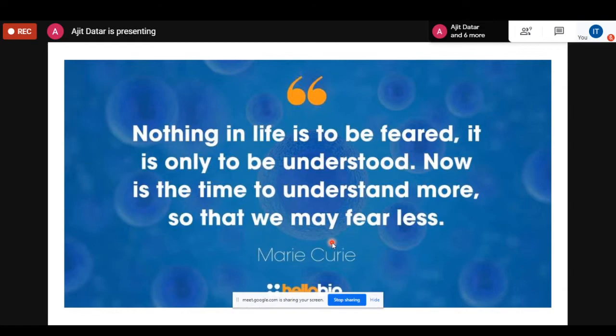Now, does he try to analyze this, whatever information he's getting, which is very complex, by using any bioinformatics tool? He knows which proteins he's analyzing, the source of proteins he is analyzing, whether he could get any information from the data which is available, any informatic tool where databases are there for similar kind of proteins, whether he could get some information from there. So he has to look into those aspects because he probably has collected huge amount of data. Now that needs to be properly analyzed.